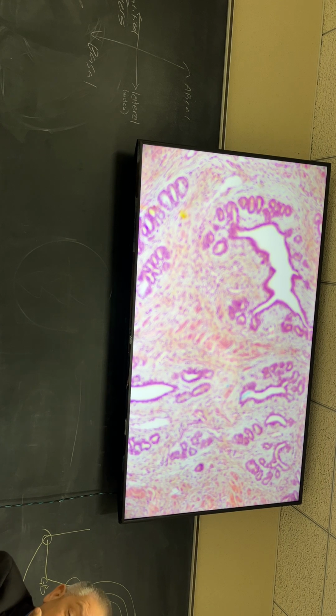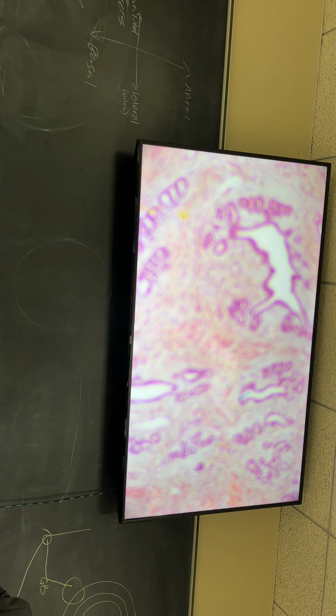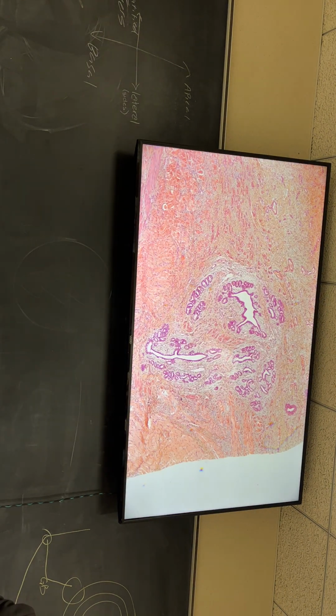This is like your final exam here, people. What is that? You may go down one more? Those look like lines. See that? It is a gland. How about that? Who knew you had glands on there? Piece of cake, right?